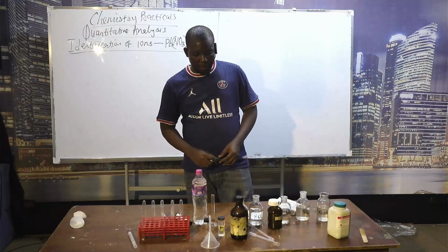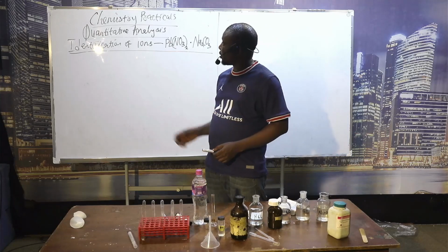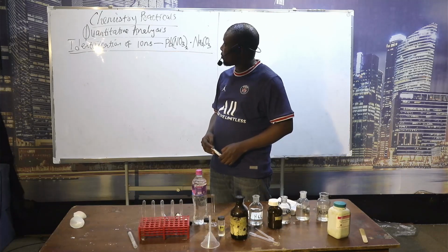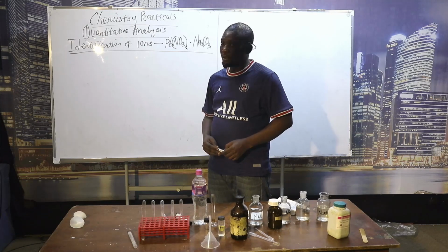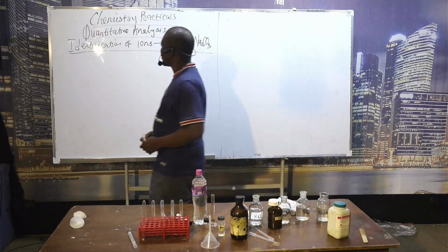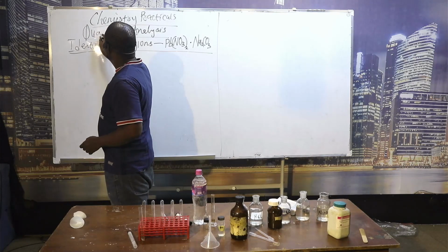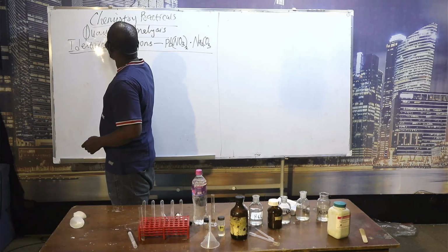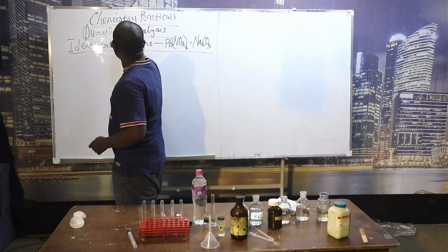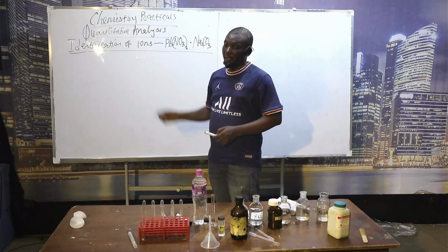Hi viewers, in this video we are going to be looking at qualitative analysis. Qualitative analysis, that is identification of ions.